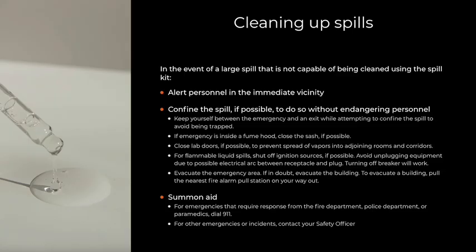Evacuate the emergency area. If in doubt, evacuate the building. To evacuate a building, pull the nearest fire alarm pull station on your way out. Summon aid. For emergencies that require response from the fire department, police department, or paramedics, dial 911. For other emergencies or incidents, contact your safety officer.